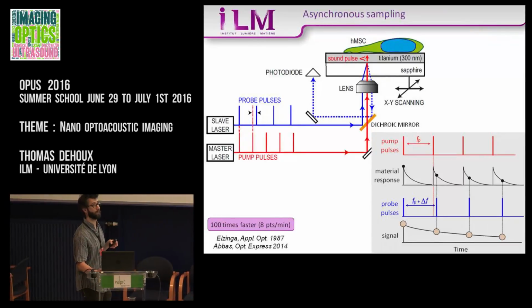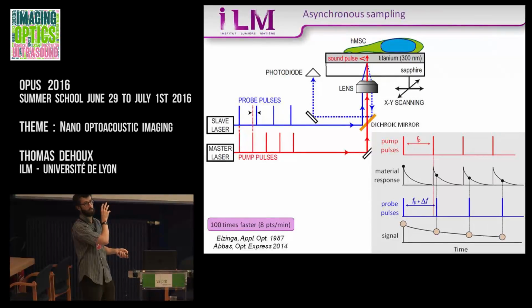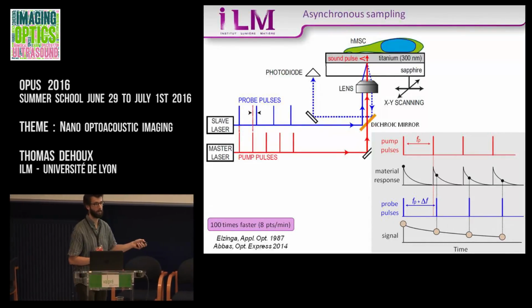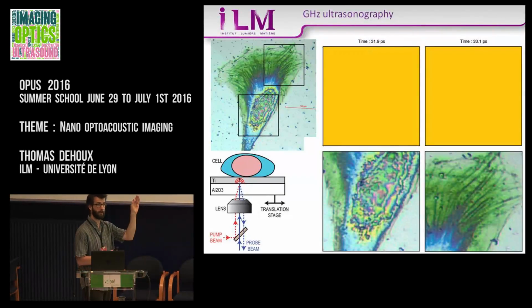The detector is a photodiode, correct? Yeah, but you can use a photodiode in the megahertz range, because you have just one point every repetition, every pulse, and the repetition rate is the repetition rate of the laser. Typically, it's 50 megahertz. So you need a photodiode which is faster than 50 megahertz. And if you use the delay line, you're just sampling at a given time. You stop the mirrors, so you're just probing at one time, and you can integrate as long as you want.